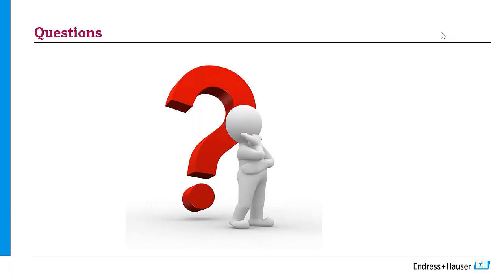Another question: have you changed the bulbs on the new sensors? When you say new sensors, are you talking about the CUS52D?